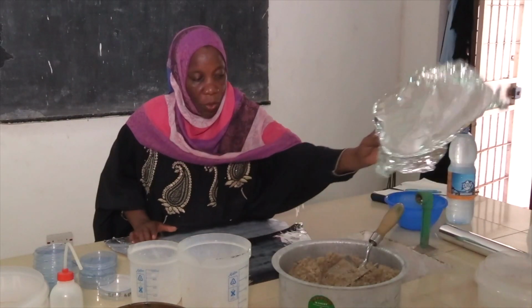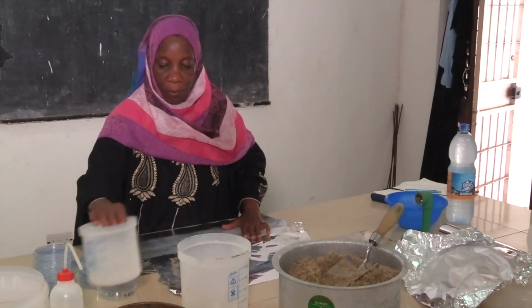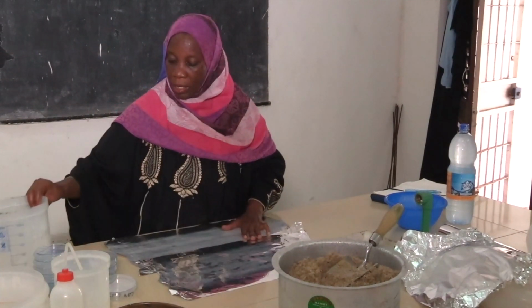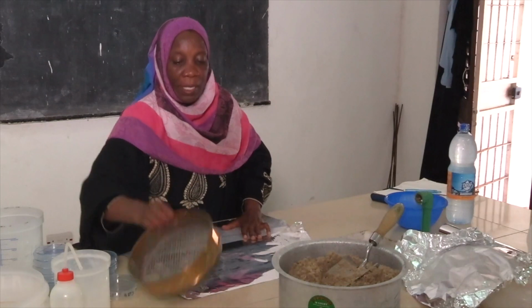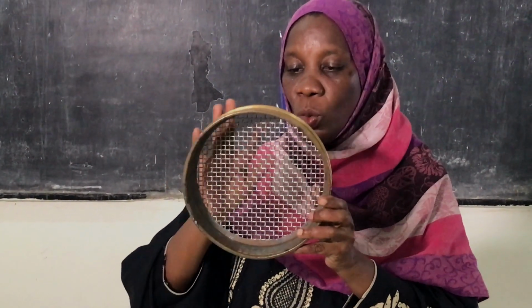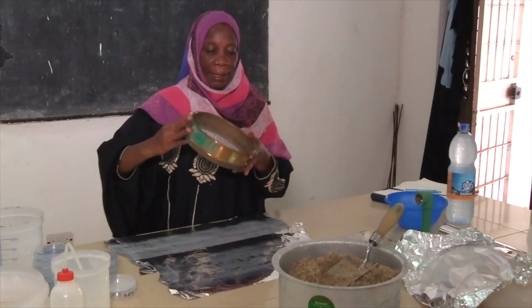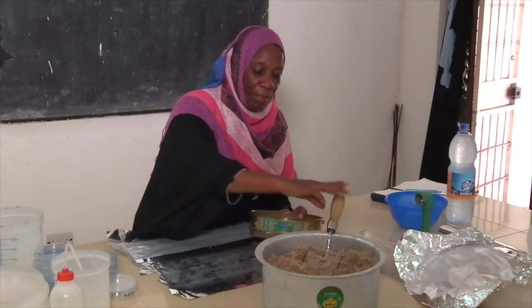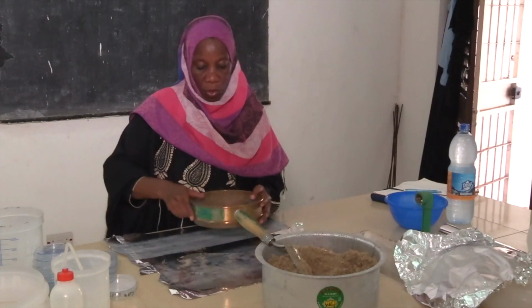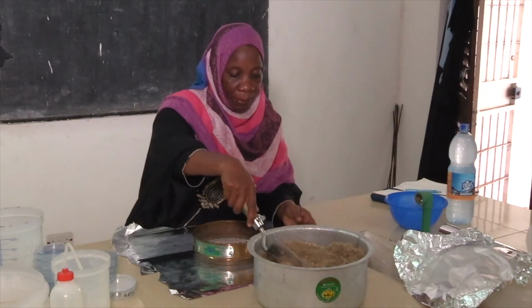And now we want to measure our sample, our replicate. We continue with our replicate. And the first step, we have to sieve it through the 5 millimeter sieve plate. This is a sieve plate, in which each square is 5 millimeters. So we sieve all of our sample through this.